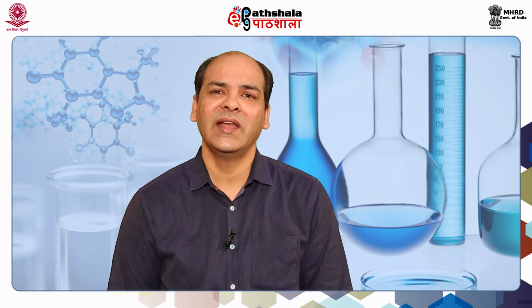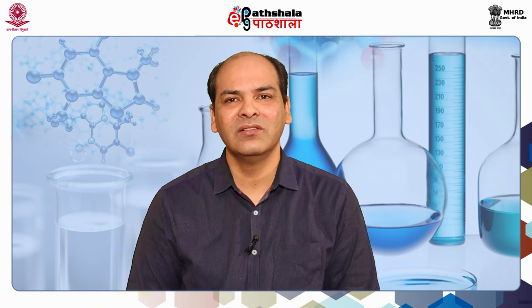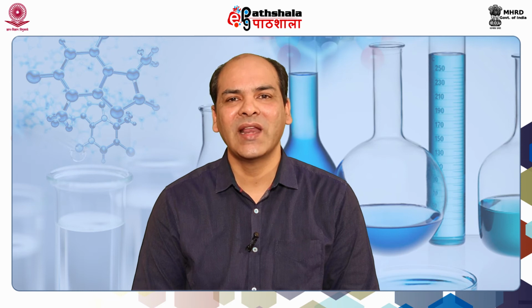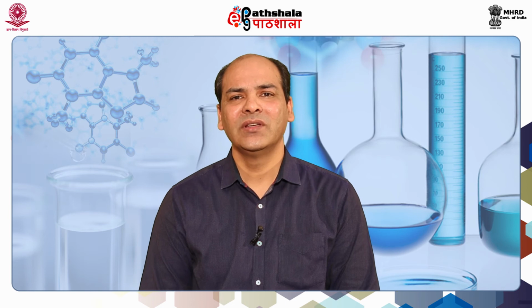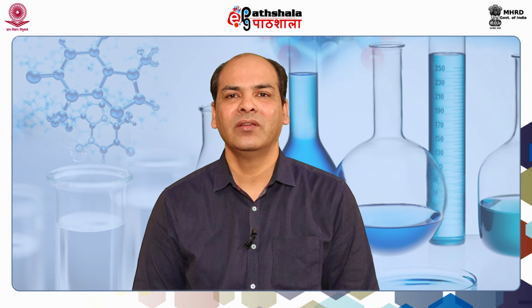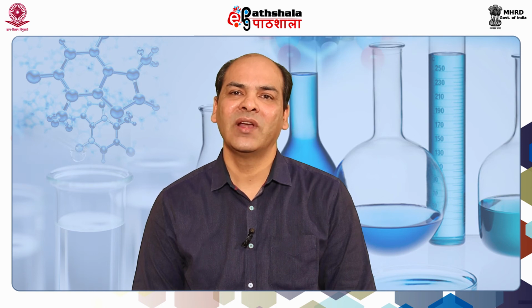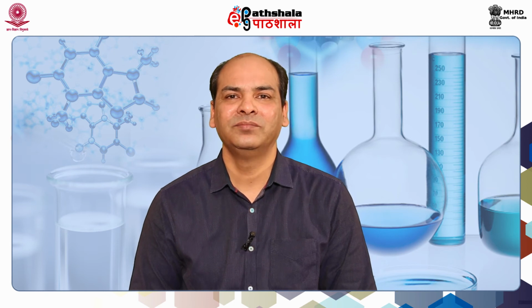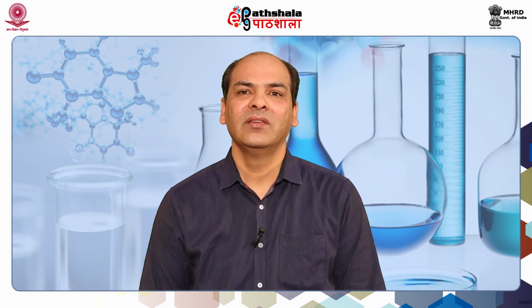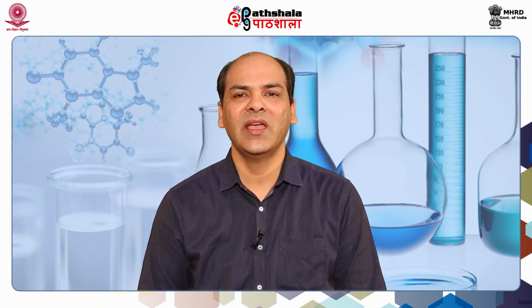But now we have to understand what is the molecular mechanism or the structure of the molecules, biomolecules, which are impacting the circular dichroism or ORD. So we know now that the reason behind is molecular asymmetry. We had to find out what the causes of this molecular asymmetry are and how it is leading to the optical activity of the molecule. The molecular asymmetry is the central point which is leading to the phenomena of circular dichroism and ORD.